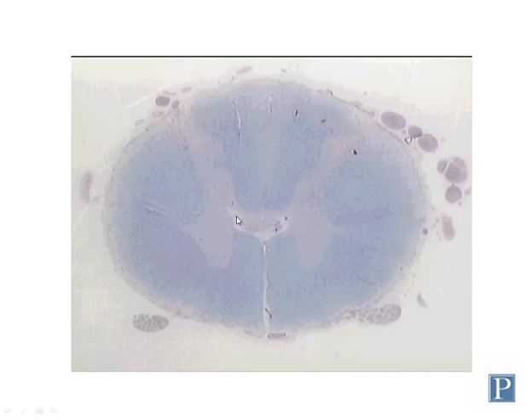Note that the spinal cord is symmetrical bilaterally, so the left side and the right side look very similar, and the major mass of the gray matter on the left and right side is connected by this bridge of gray matter here. This is called the central gray commissure. Commissures, as you'll learn later, are regions where you have connection between two sides.